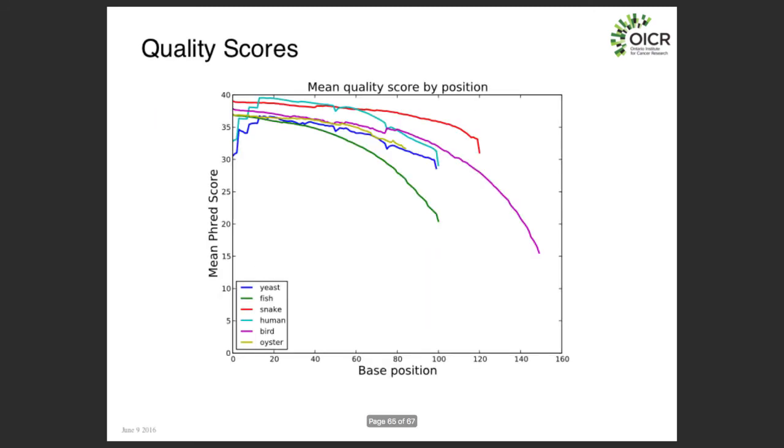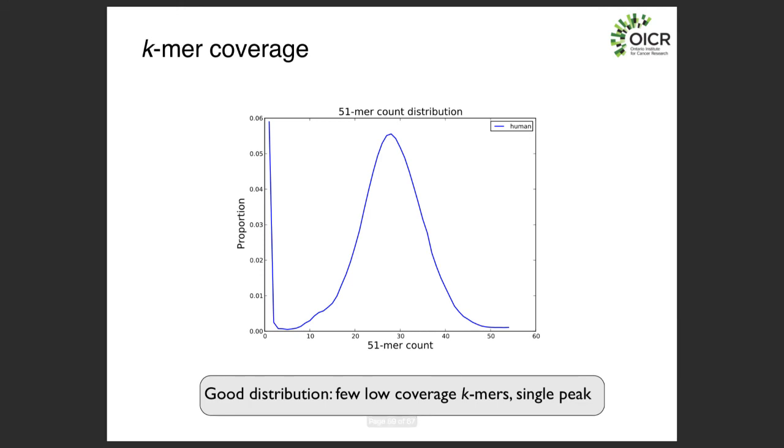Yeah, so this one here is not exactly the same as the genome coverage that I described to you before, because k-mer coverage is going to be a fraction of genome coverage, but we're at about 27, 28x 51-mer coverage, which corresponds to about 40x base level coverage. It's a little confusing, but this plot is correlated with genome coverage.